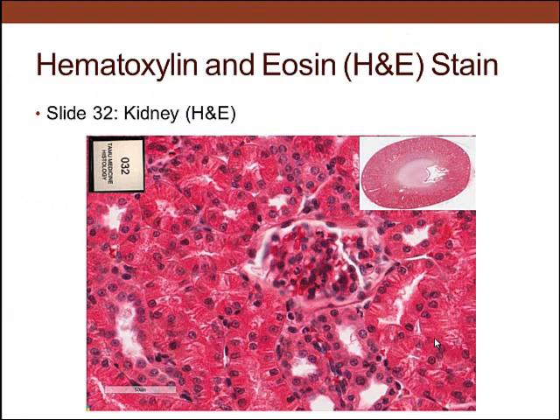So what we will see, again, we're in the cortex and in the medulla, and here we can see the proximal tubules and the very eosinophilic staining thereof. In contrast, this is a distal tubule. It's not as eosinophilic. Also, in the proximal tubule, nuclei are far apart, but in the distal tubule, nuclei are close together.